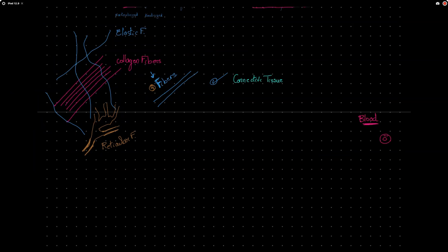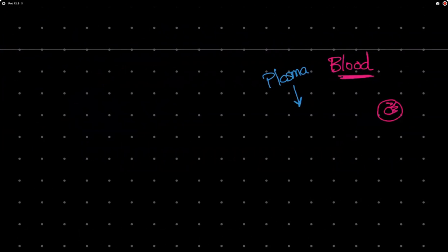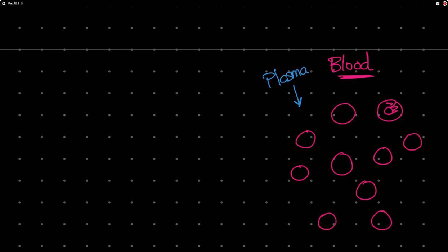Blood has a very characteristic appearance. I have a clear matrix, which is my plasma. It's clear. It has nothing in it. What I can see scattered on this clear matrix are the different types of the blood cells. And the most common of them is going to be the erythrocytes or the red blood cells. The erythrocytes will have very characteristic appearance. They are reddish in color, with dark peripheral edge and pale center. So I'm looking here at the erythrocytes.